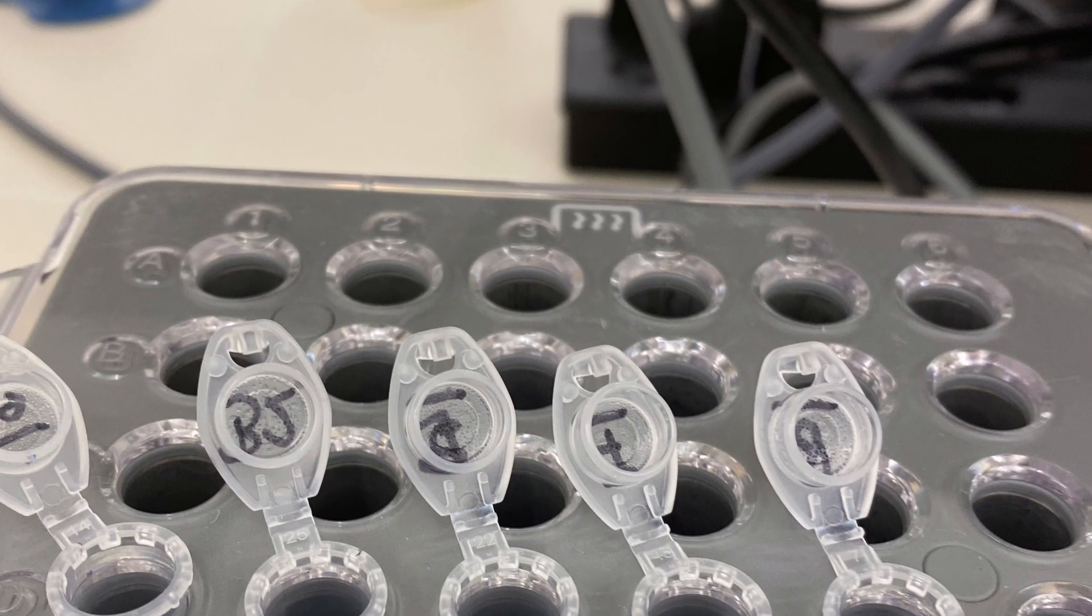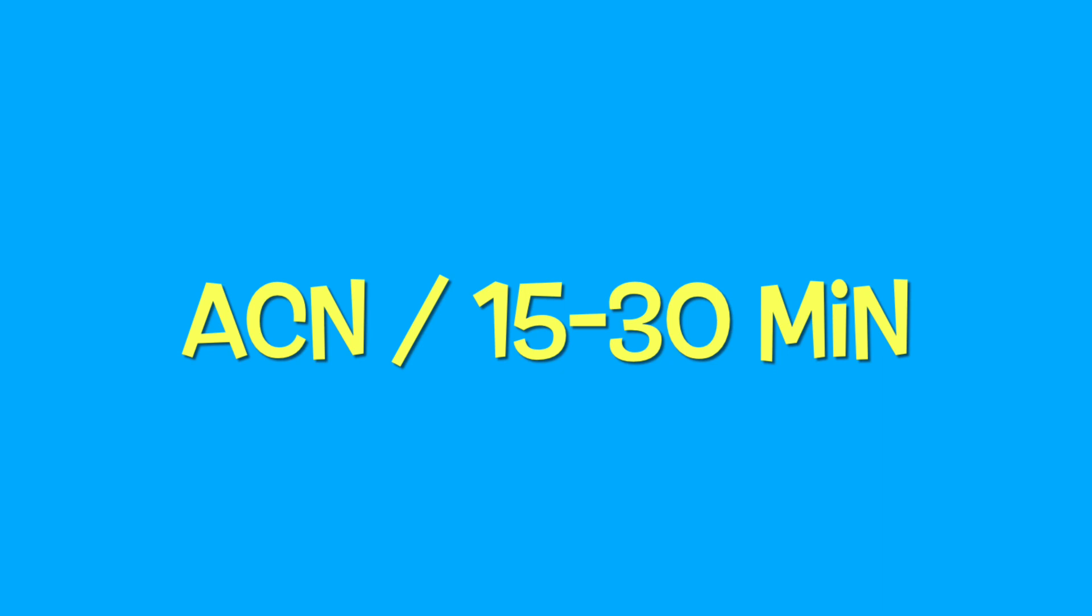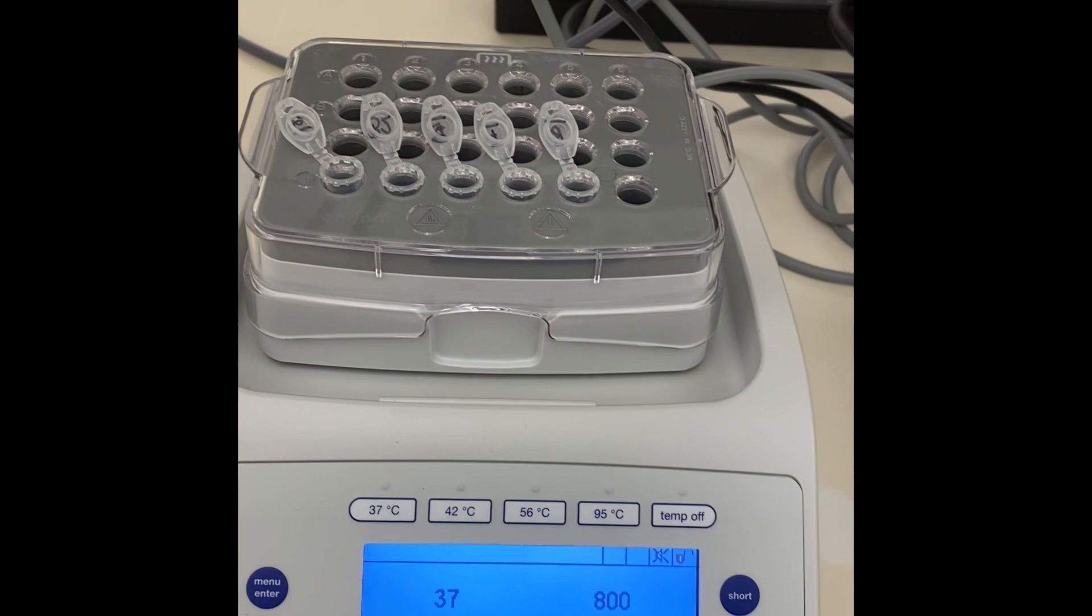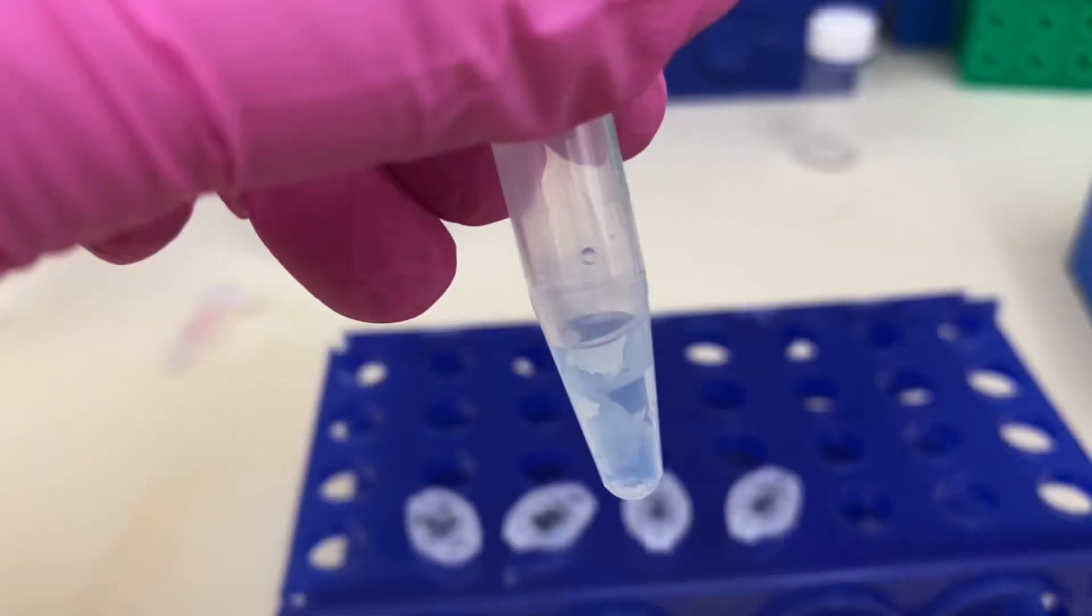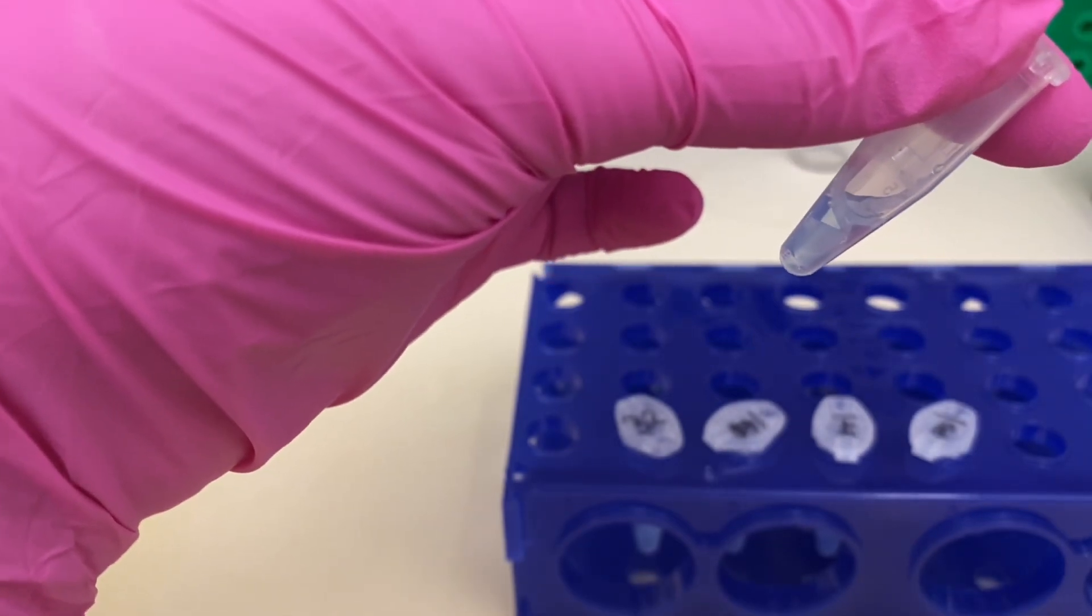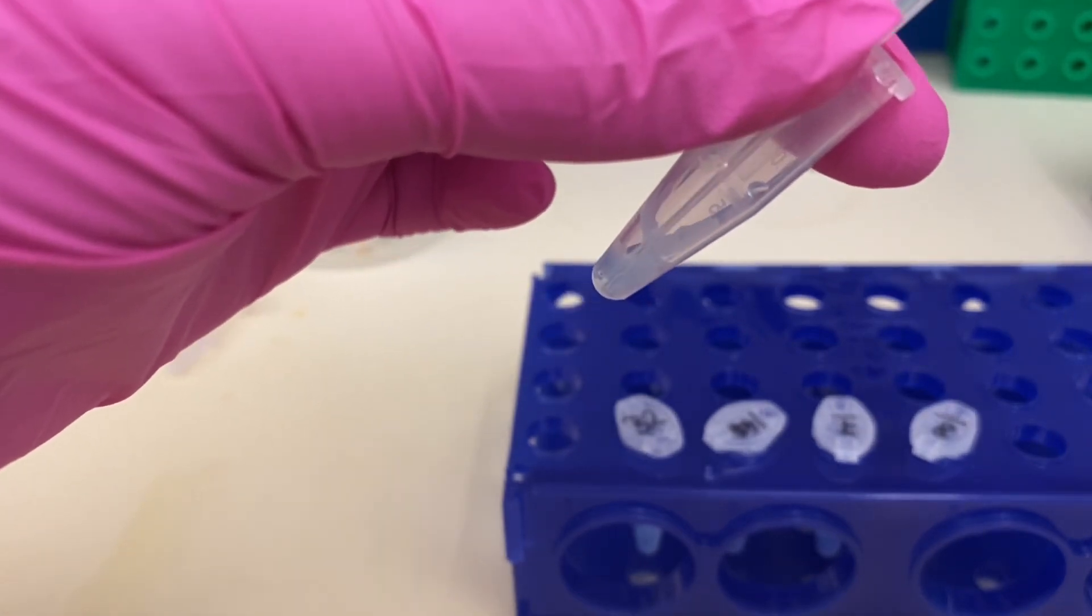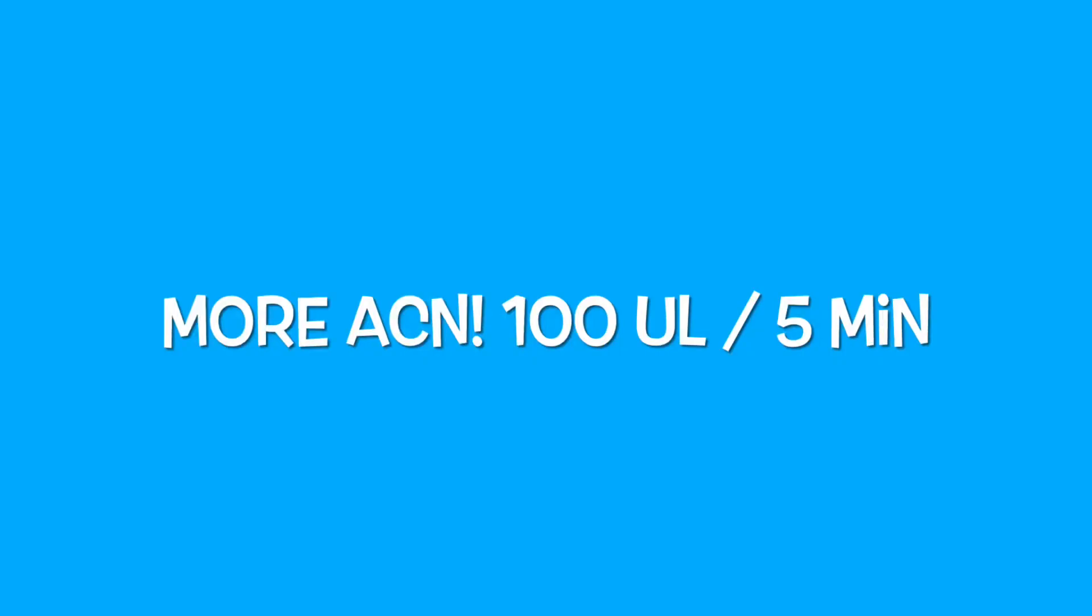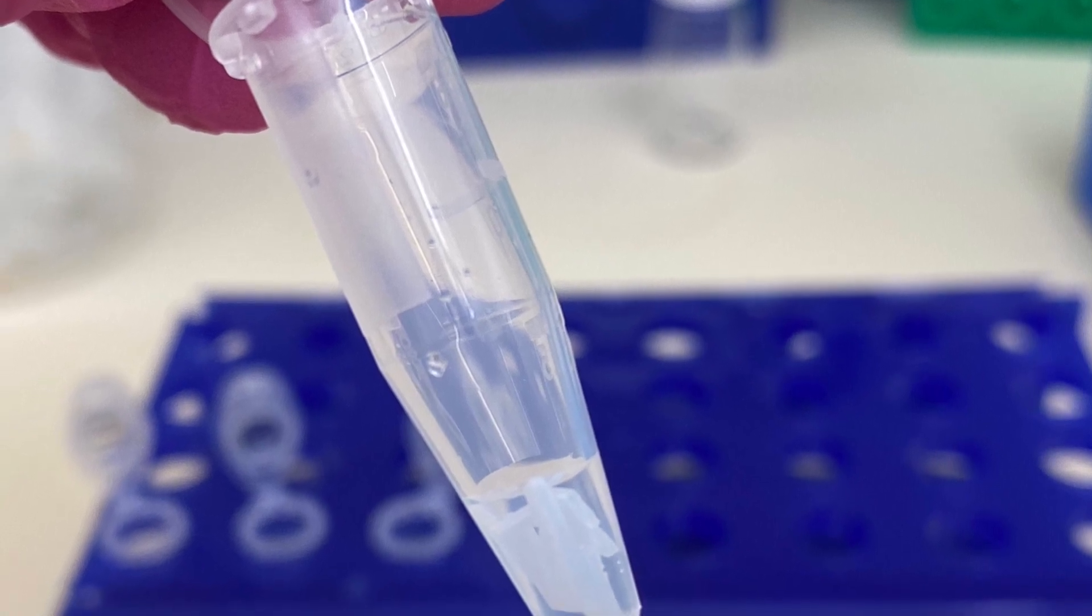After 30 minutes, I will open my tubes, still keeping them in my thermal mixer and add 100 microliters of ACN. I will continue shaking for additional 15 to 30 minutes depending on how stained my samples still look. You can see from my tube how my gels look like now. They definitely shrunk a little and look whitish. I will remove the liquid from my tubes. After I removed all of my liquid, I'm going to add actually more acetonitrile. So I'm going to add it and leave for additional 5 minutes and after that my gels will look super shrunk and white.